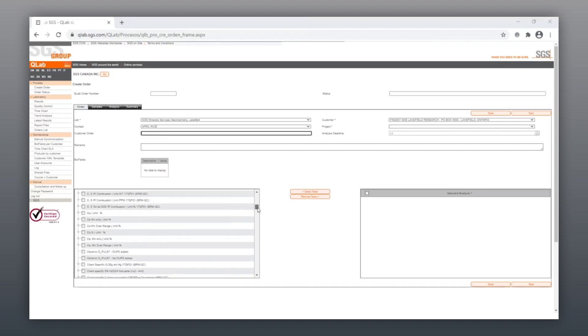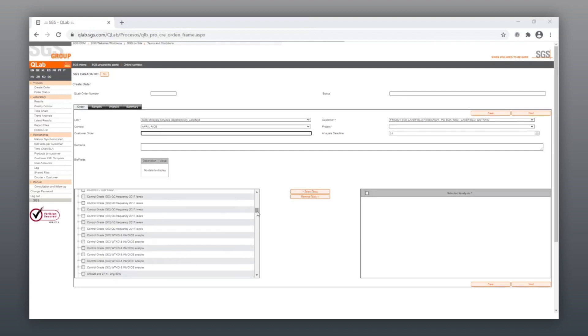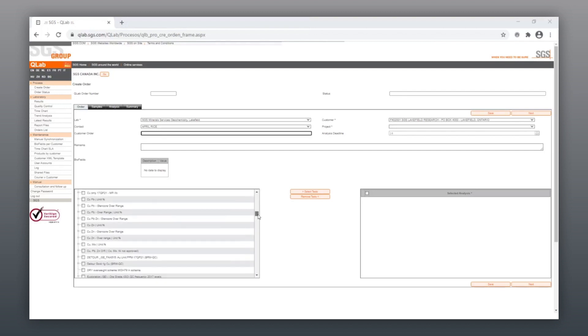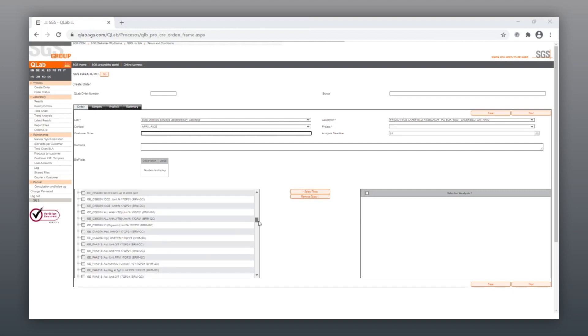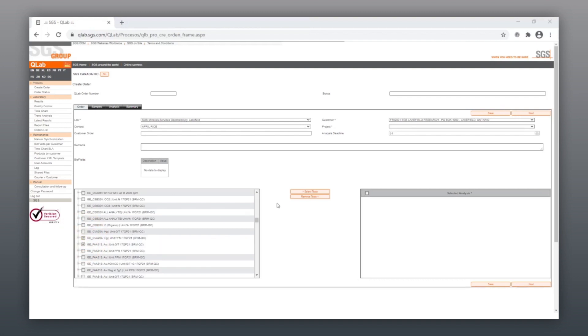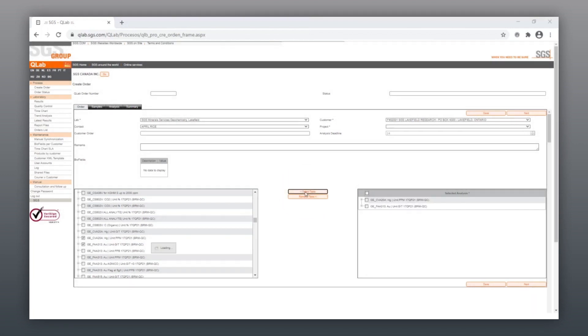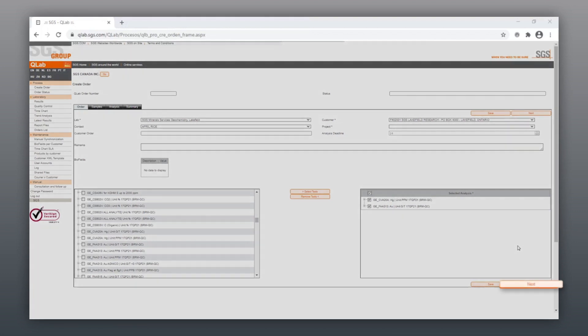Choose your desired methods from the All Analysis table. To select a method, click on the checkbox beside your desired method analysis and then hit Select Tests to move your desired analysis over to the Select Analysis section. Once you've selected all your analysis, click Next.